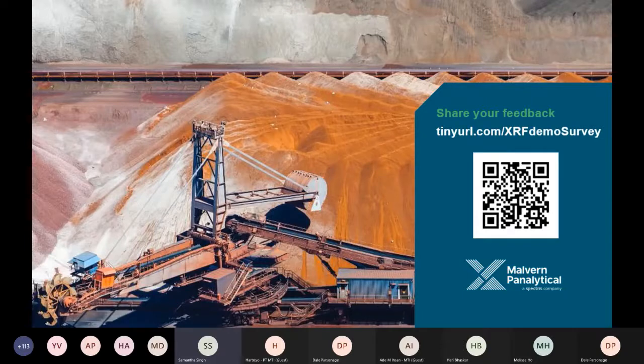Okay, thank you very much. I have a couple questions for Harry, and then I think we will start to close off the session. So Harry, just want to ask, if we do up to 200 samples per day and use press powder, which instrument would be recommended?